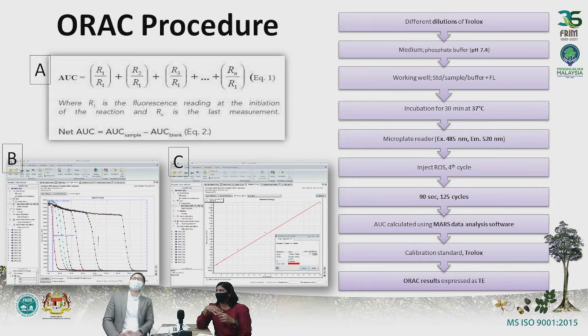So imagine, just now you mentioned 12,000 data points. Calculating 12,000 data points using Excel, for example, would be quite tedious, I would imagine. So I'll definitely have a demo to show the audience here. As Shalini mentioned, her calculation actually used MARS data analysis software by BMG LabTech. This software only comes with the BMG LabTech reader. But before I show a demo of that software, I'd like to touch on one more question since we're at the procedure.